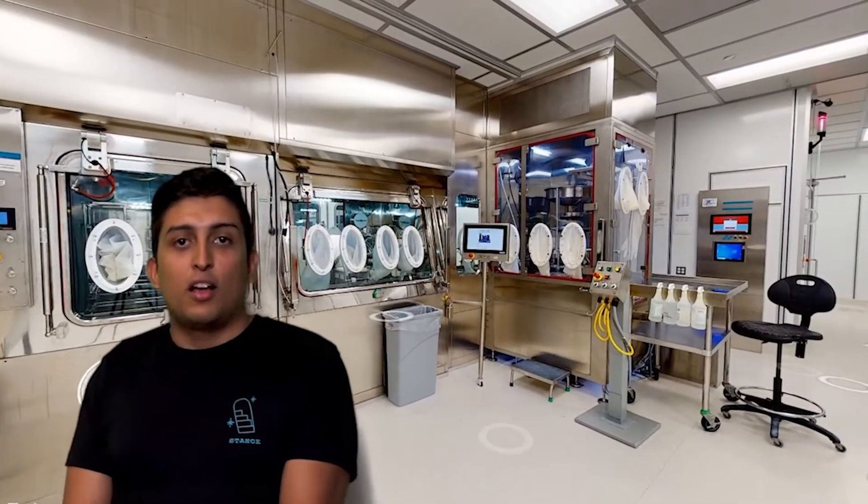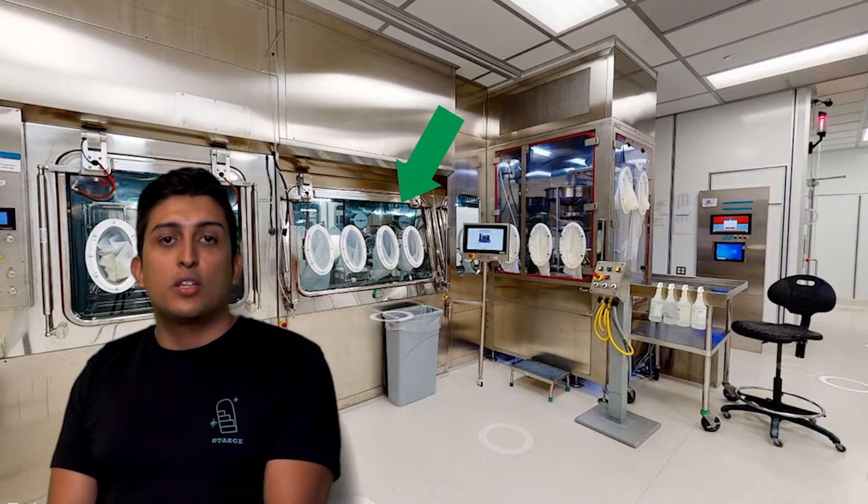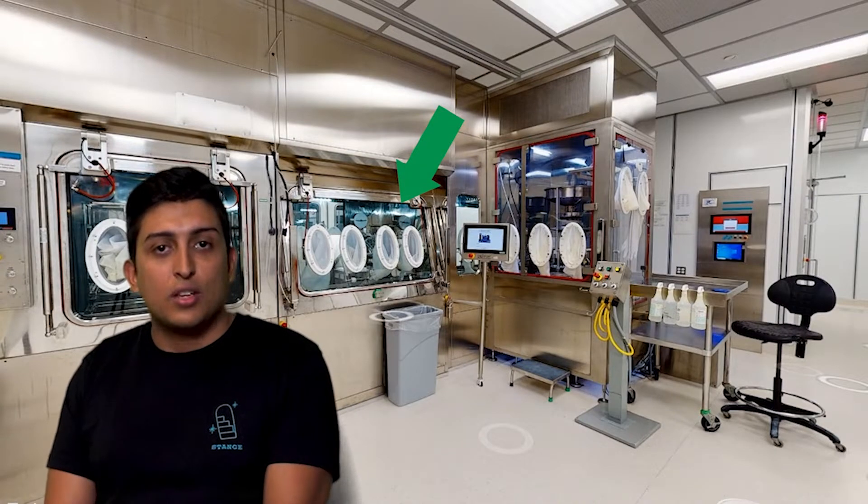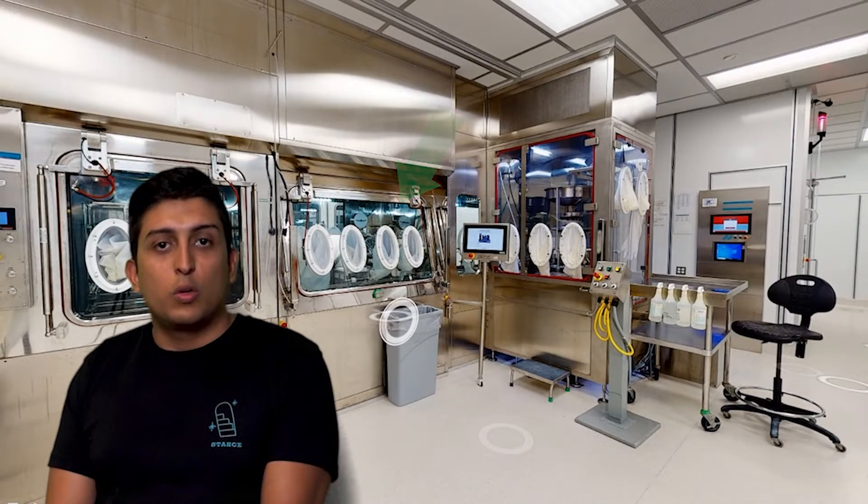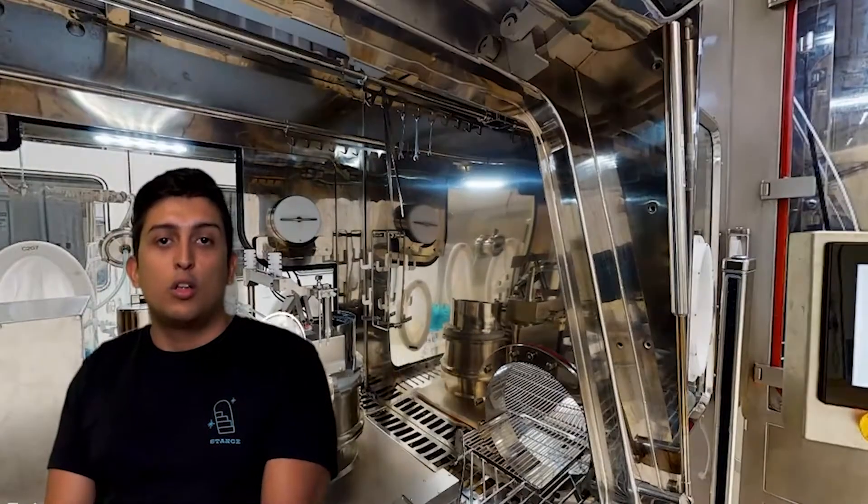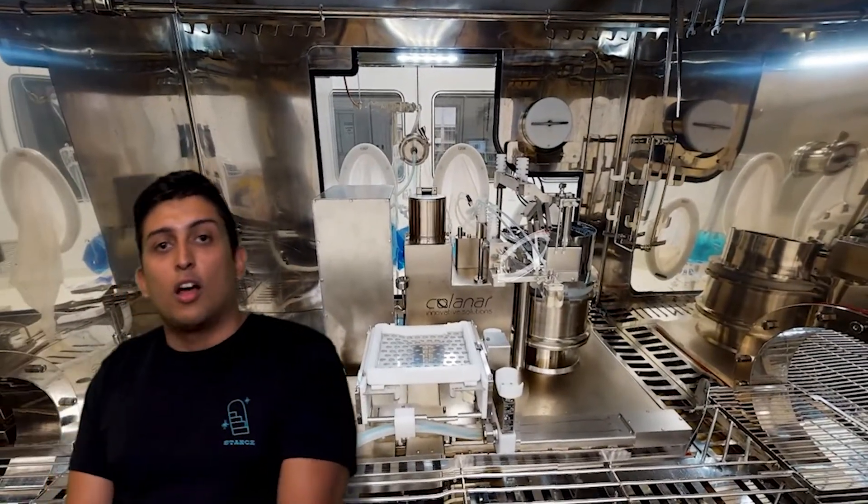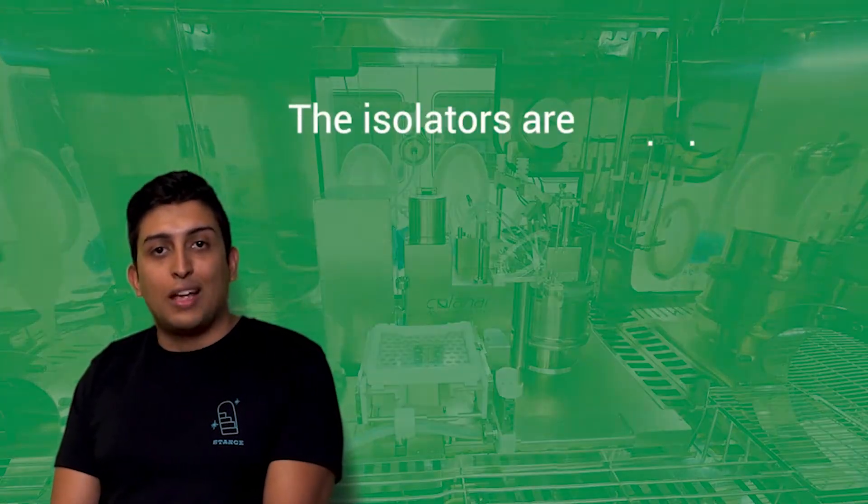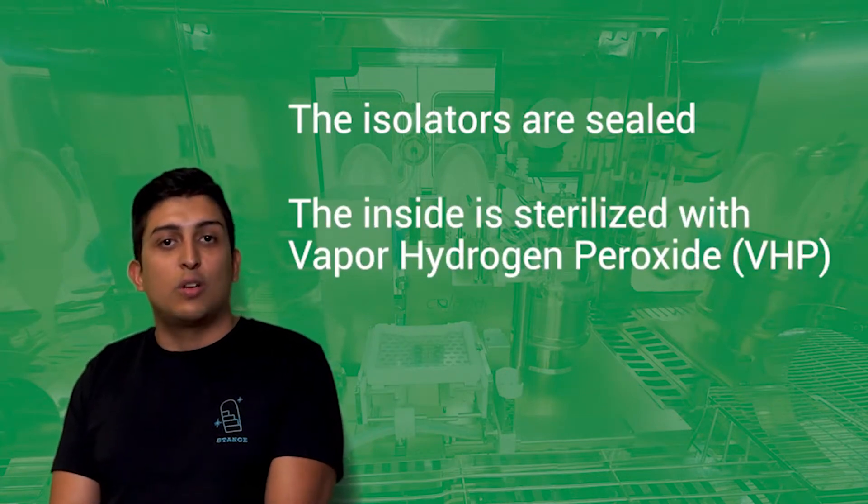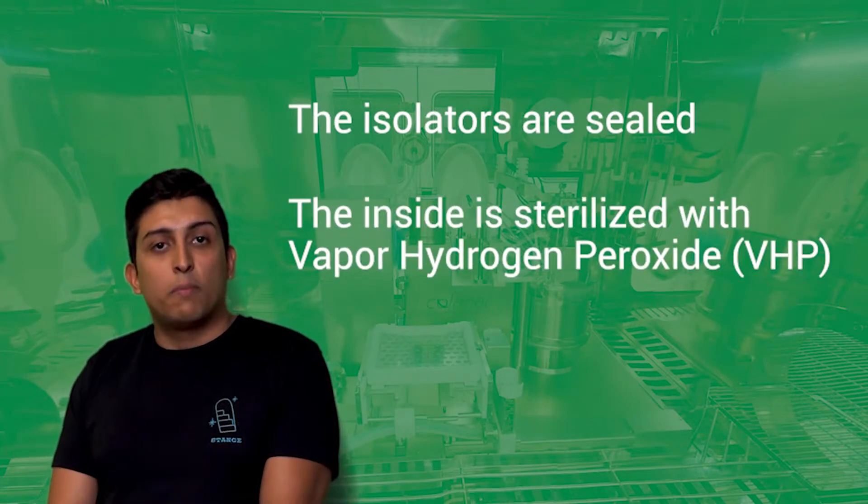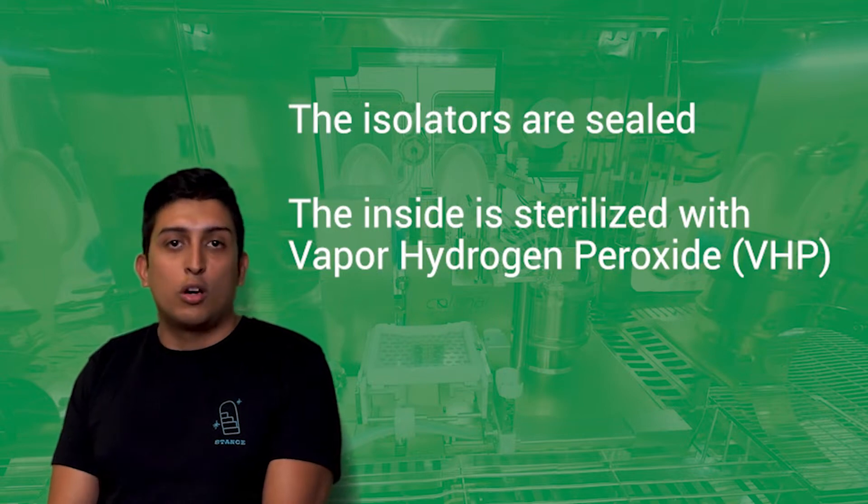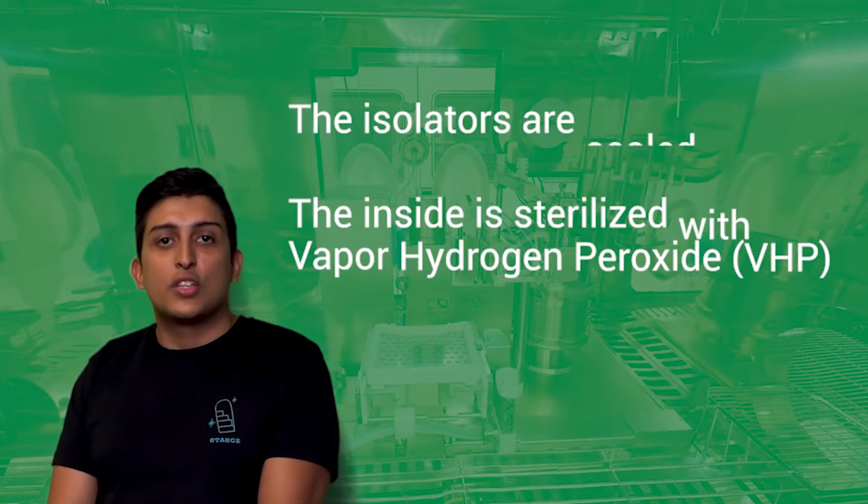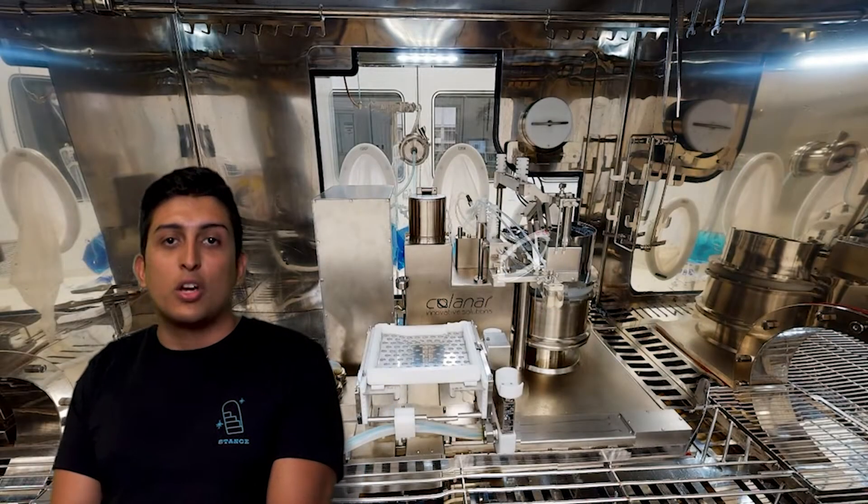All right, here we are. Do you see how there are enclosed spaces surrounded by stainless steel and glass? These are called isolators, which are an advanced pharmaceutical manufacturing technology. The isolators are sealed, and the inside is sterilized by pumping in a high concentration of sanitizing gas, vapor hydrogen peroxide, or VHP. This is the same hydrogen peroxide that you might use to clean wounds, but in the isolator, it exists as a gas in much higher concentration.